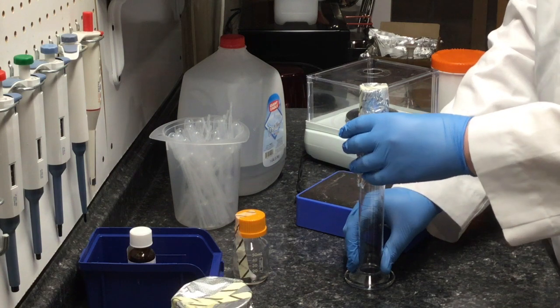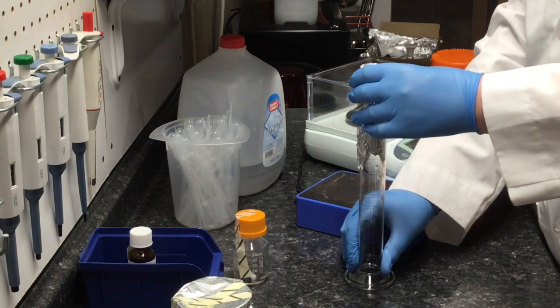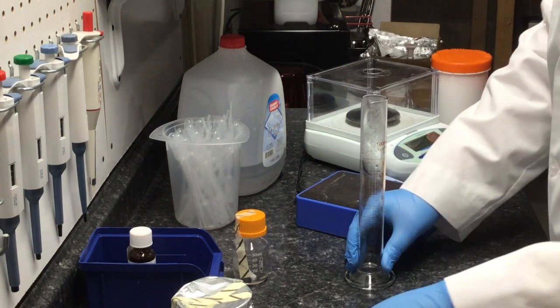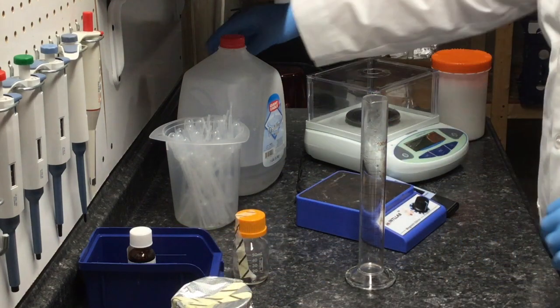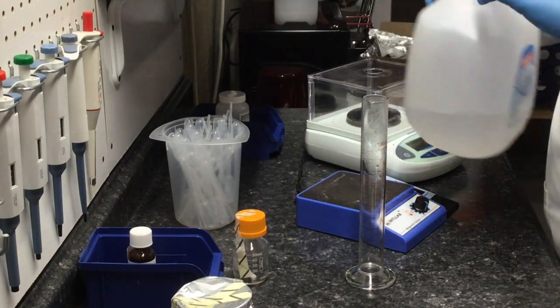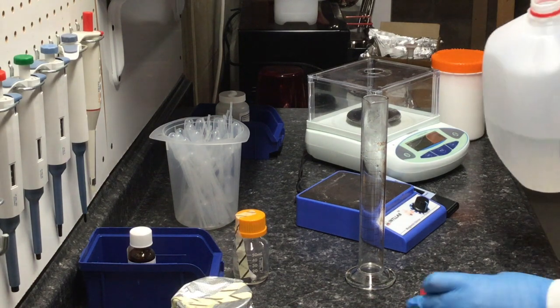I am now going to measure 40 milliliters of distilled water. Next, I will add the sodium chloride and then top it off to 50 milliliters once the sodium chloride is added.